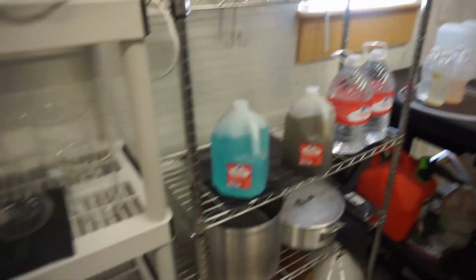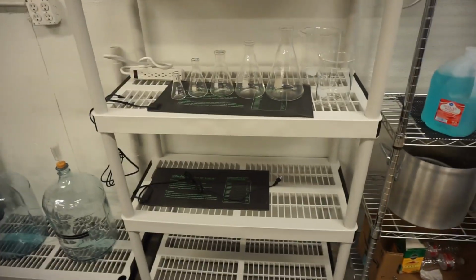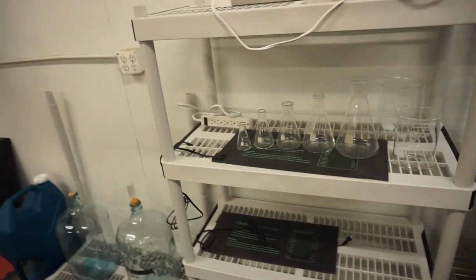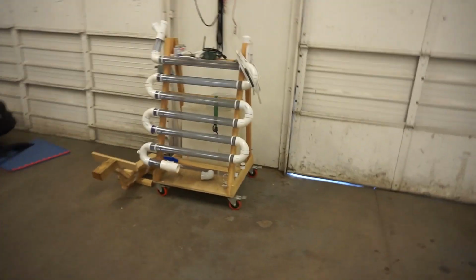We're going to use distilled water, tap water, we're going to put nutrients in it, we're going to not put nutrients in it, we're going to do all sorts of different stuff just to see what works best. Once we find the method and the specific varietal that we think is going to work best, then we're going to start scaling them up. Get them into the big guys here, then into the 1 gallons, and then into the 5 gallons here, and then ultimately over there into the bioreactor itself.